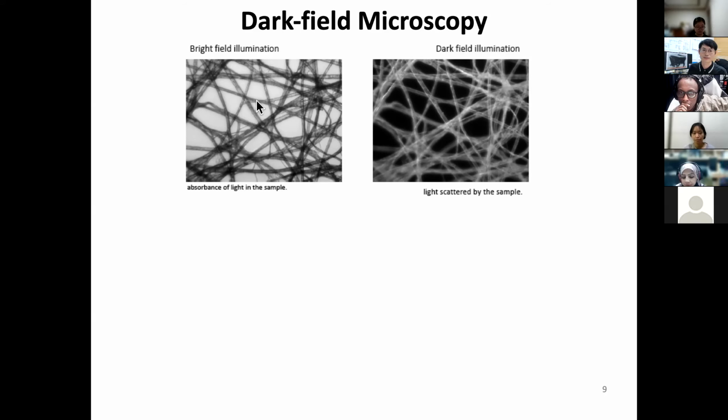However, you can see the fibers over here, but on the empty spot, these are all very bright. The reason is that direct illumination is getting onto your detector. Sometimes this can be not good, because when your sample is actually bright as well, then you may consider another way of giving contrast. So that's on the right hand side.